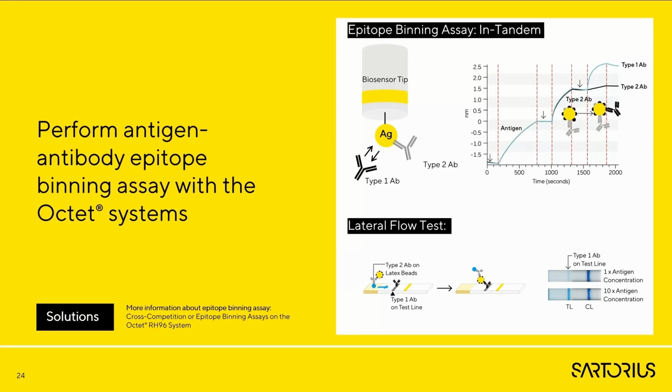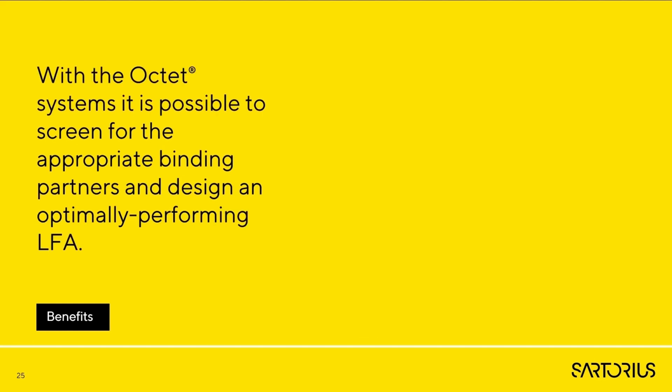Thus, the epitope for type 1 antibody was still accessible, resulting in an antibody-antigen complex with sufficient signal intensity. From these results, we could show that with octet systems, it is possible to screen for the appropriate binding partners and design an optimally performing lateral flow assay.